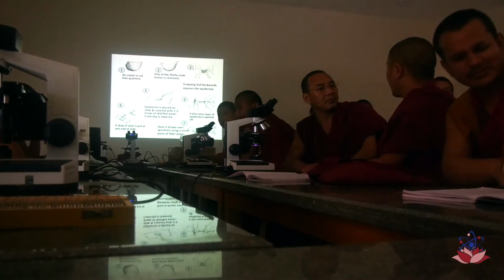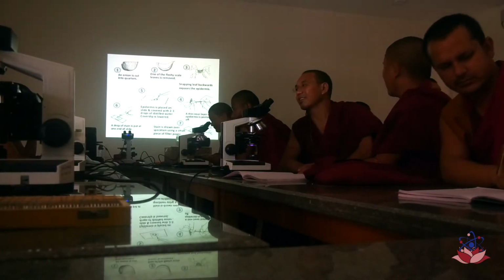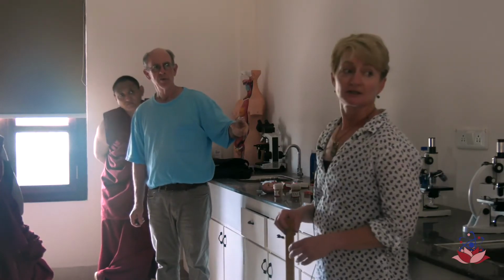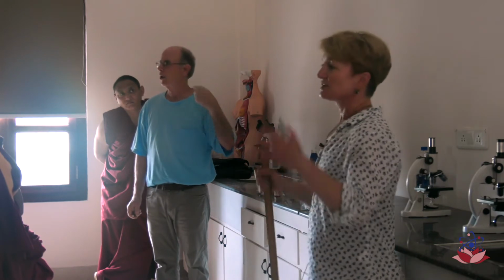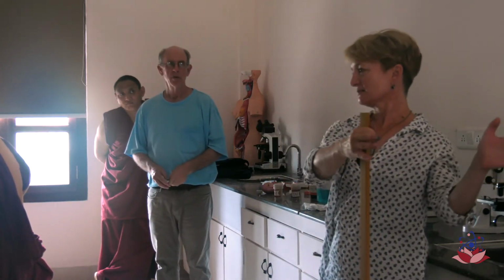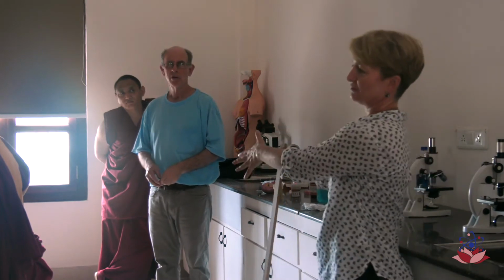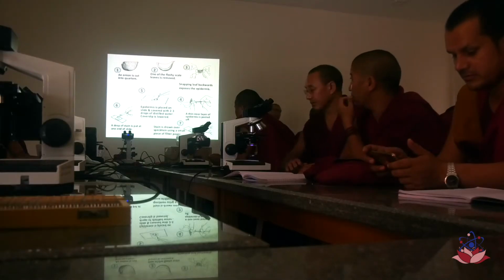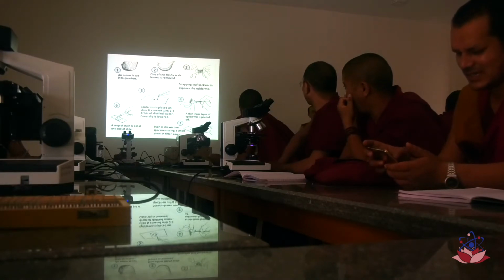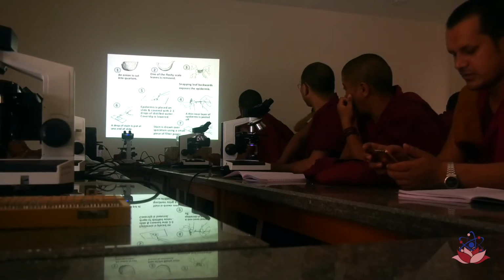Ready? You want to take maybe half of them over there and do the cheek, and I'll do half the onion here. Okay. So let's divide, and half the room will make their cheek cells first, half will do onions first, and then we'll switch.